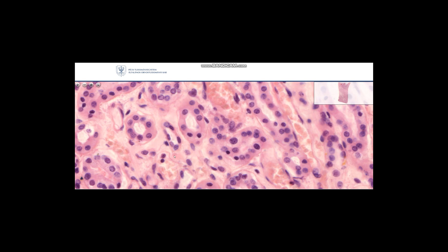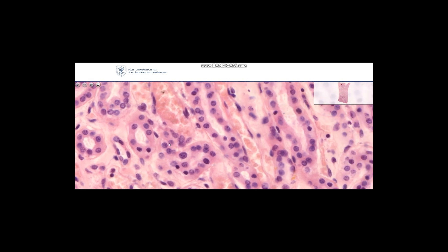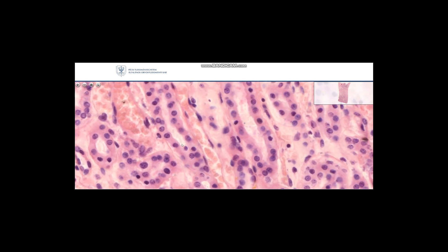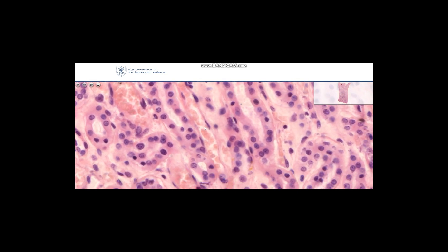This profile is the cross section of the thin segment of Henle's loop, and so this is a simple squamous epithelium. Please note that these squamous cells have a little cytoplasm and the nuclei are oval, but the longitudinal axis is parallel with the surface.